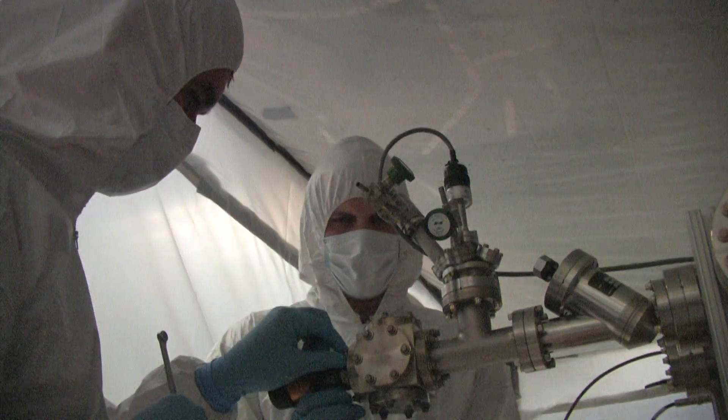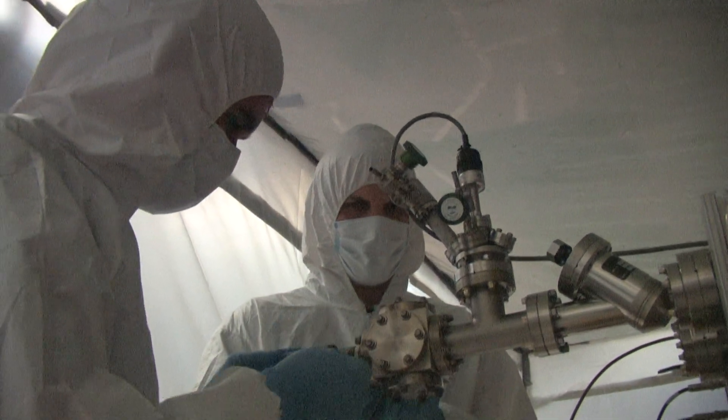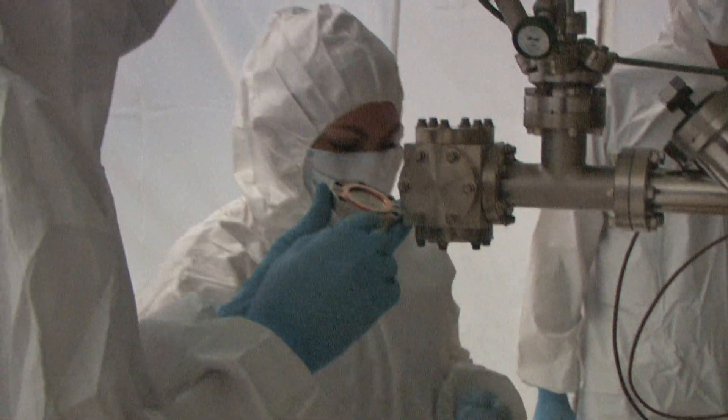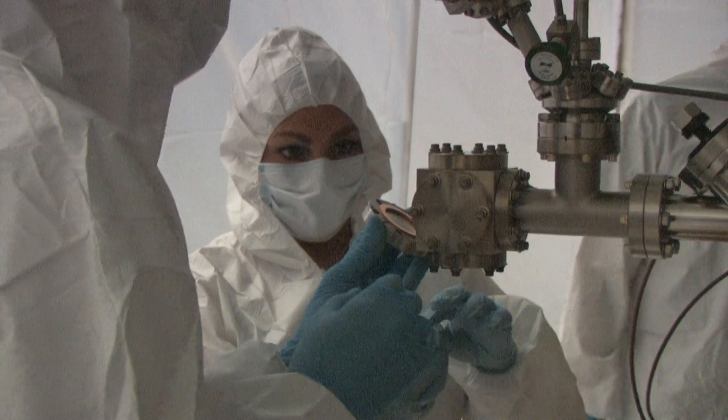Today was a bit of a repair. We knew that when we put the vacuum system together there would be potential for one part or another to leak. We isolated that part, which is a very small region of the system, narrowed it down to one particular part, removed it, and put a temporary correction patch on the system — and now we're back to normal. Tomorrow we'll be measuring spectrum from the mass spectrometer. We've had our first spectrum that we've just been able to measure, so we've actually achieved the goal of putting this thing together and doing our first measurement. We're really pleased with that.